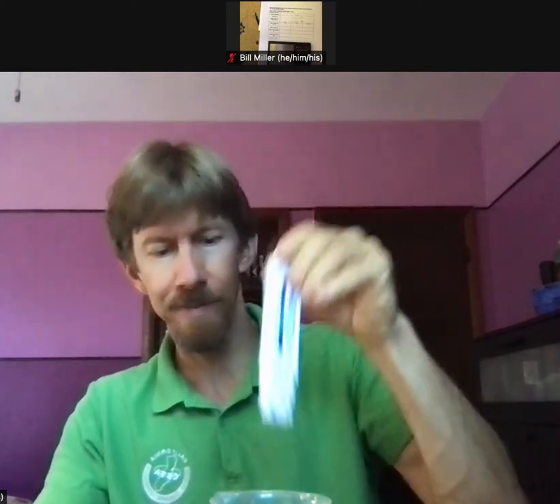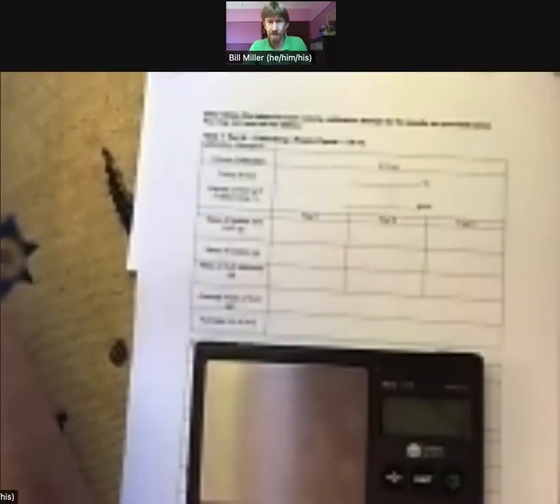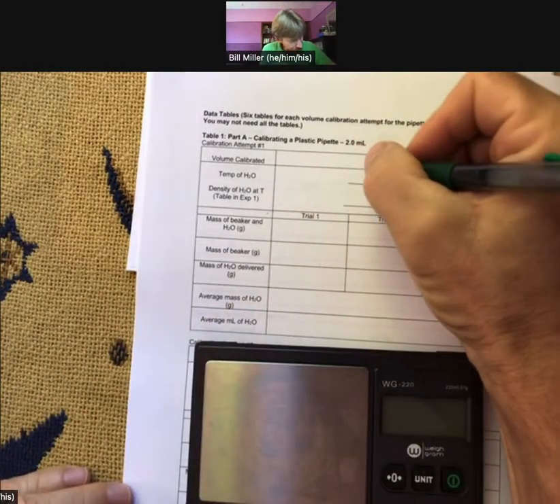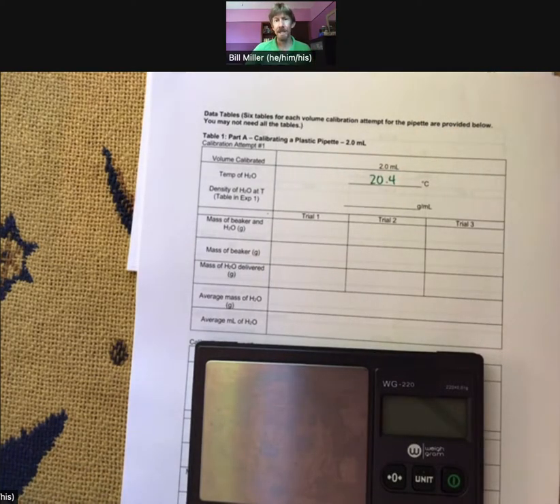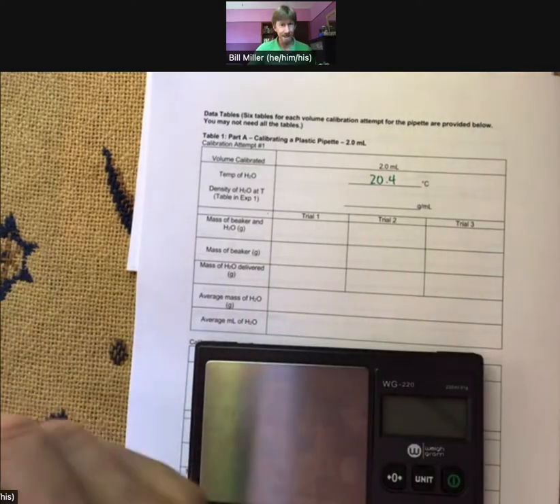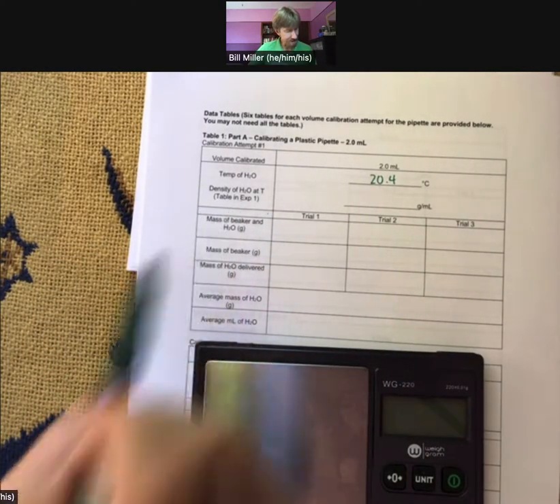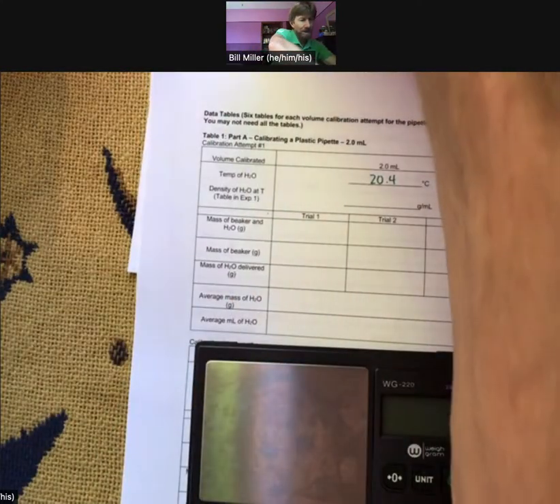Give it a little shake, turn it off, and write that down. I've got 20.4 degrees Celsius — and of course we always write the tenth place. Now I'm going to need this to get my calculations. I'm going to need the density of H₂O at a specific temperature.